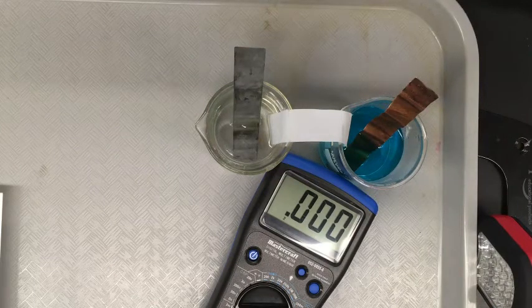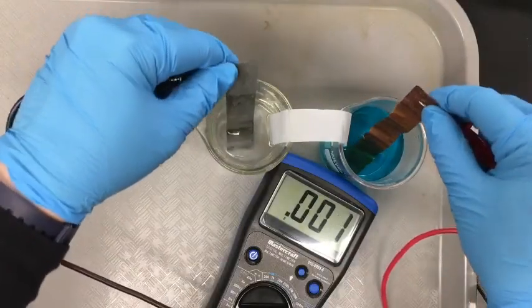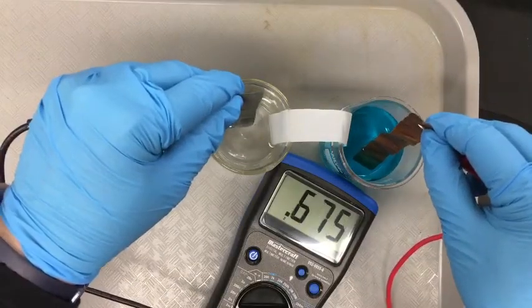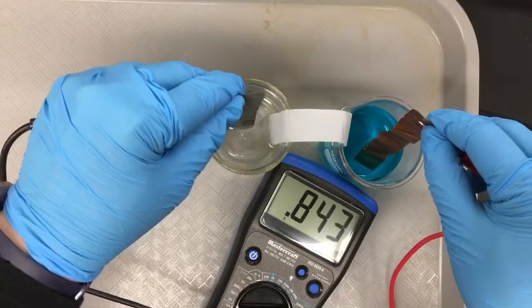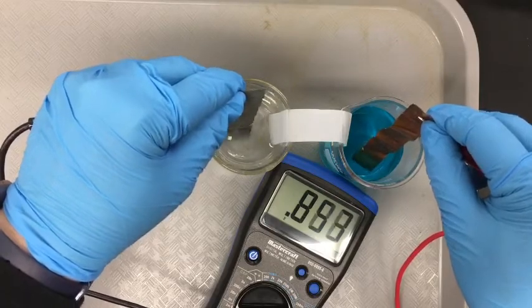And we are going to hook up our electrodes here by using a digital multimeter. So I have this to the 2 volt range. We're not going to get very high voltages since we've used a low concentration. So I'm going to touch the electrodes to both of them, and then we'll take our reading. I'm just going to lift them up from the solution to help it stabilize. So for this one, we're getting a reading of approximately 0.85 volts.